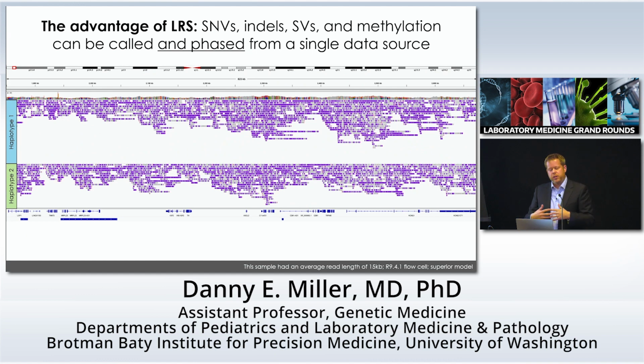And then you can step back and you can look at larger regions. We got good phasing with this individual, even though we had relatively modest read lengths of around 15 or so kb. This is looking at a nearly 1 megabase region. This is the end of chromosome 11. So you have KCNQ1 here, and then you have the two imprinting centers somewhere over here. The screen's a little small on the laptop.